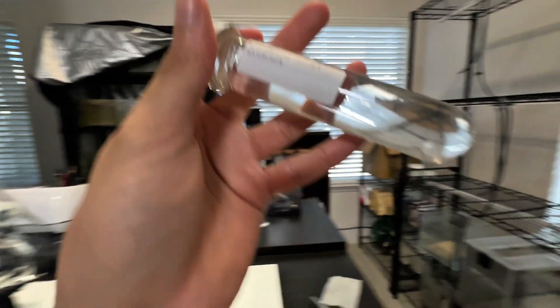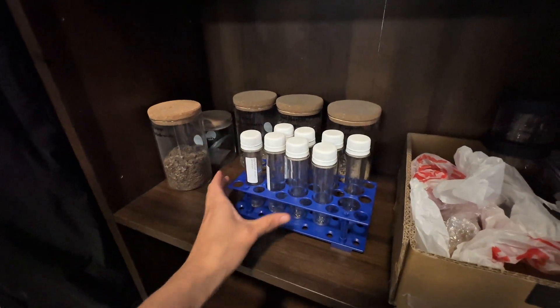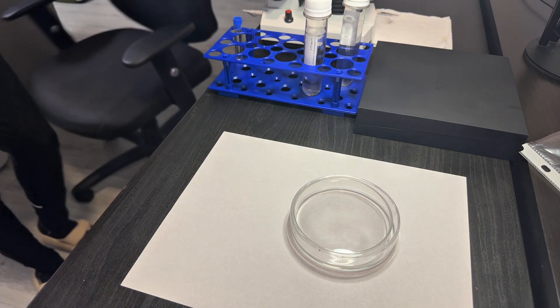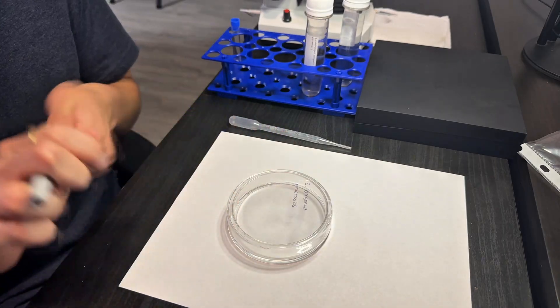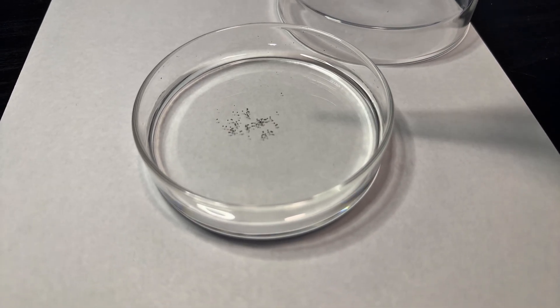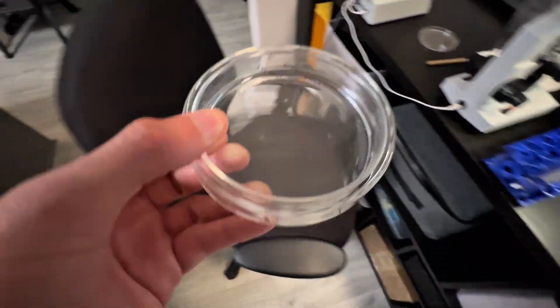The vial is placed in a spot with indirect sunlight at room temperature for about a month. After this initial period, I prepare a Petri dish for the next stage of the process, which involves cold storage. I label the Petri dish with the species name and date, add a thin layer of water, and transfer the eggs into the dish using a pipette. This dish is then sealed and stored in the fridge at around 4 degrees Celsius for about 30 to 90 days.